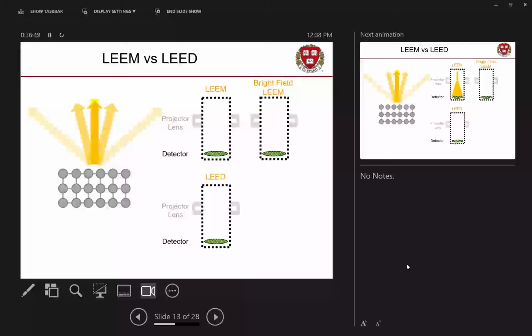Okay, cool. So all these conditions apply inside the LEEM. If you've got a crystalline sample, you've got the crystal. We certainly have our beam of electrons, which means we should be getting these. And in fact, we do. And this actually causes a problem. All of those electrons are, from the tool's perspective, just electrons.